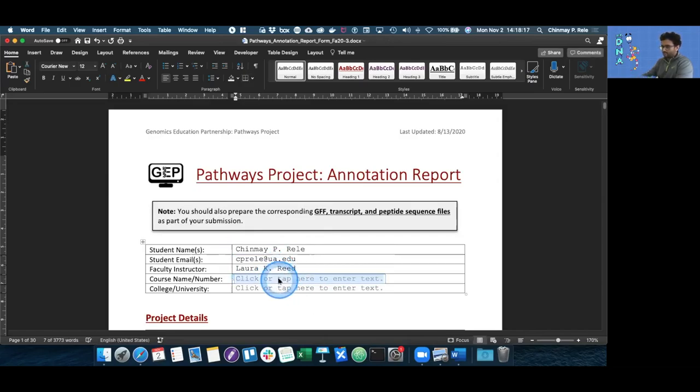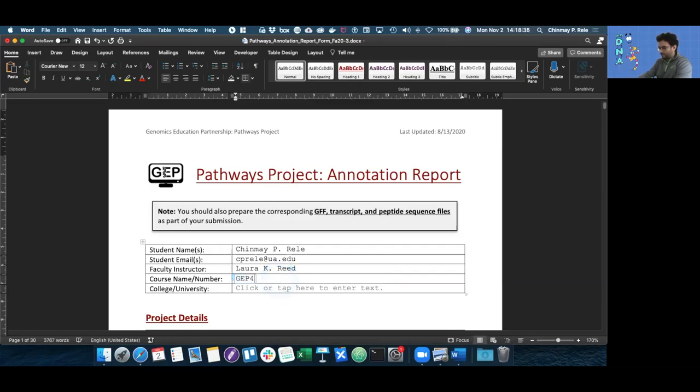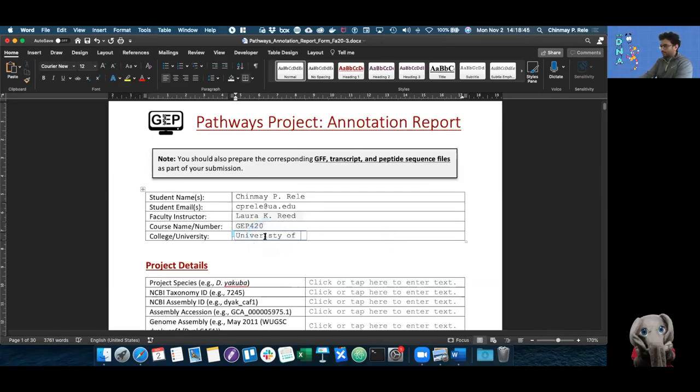Now we need the course number that the faculty who gave you your gene for the GEP is teaching. Since I don't have one right now, I'm just going to put an example, GEP 420. Then we need the university. Since I'm at the University of Alabama, that's what I'm going to type in.